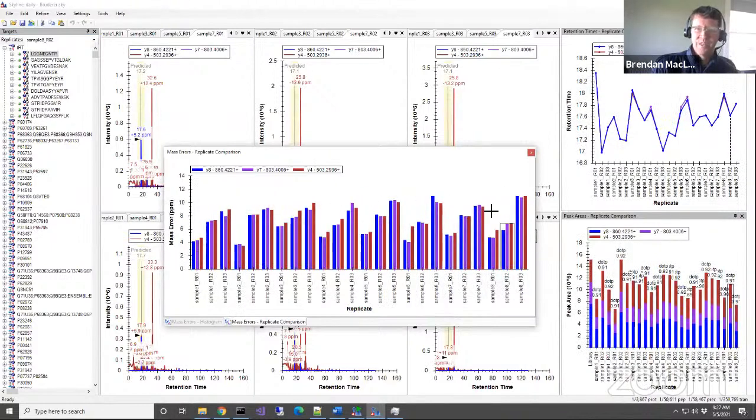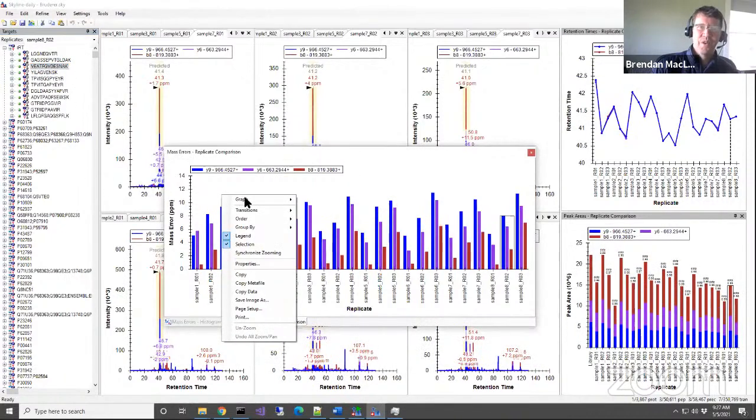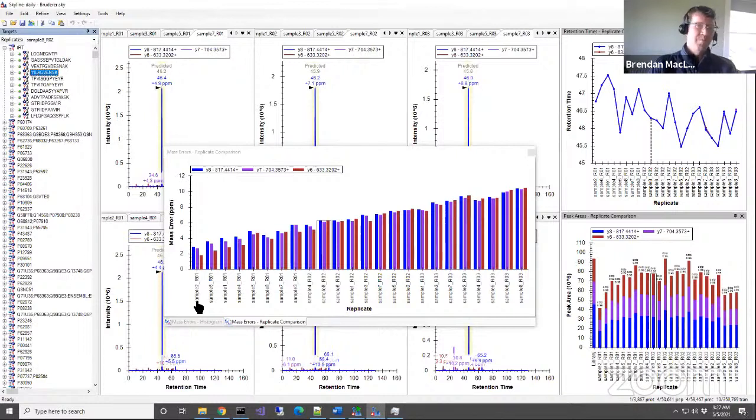So now we can see that for that thing over time, it's not super obvious that there's a... oh wait, but we got to order by acquired time. And there we start to get at the question. The true question was, maybe there was drift. Yep, there was drift. It went all the way out to 10. So in the last replicate, we're pretty far off, which explains why we start to even think that being far away from 0 might be a good thing, right? When we looked at the score and it was negative to our expectations, it might start to be a good thing.